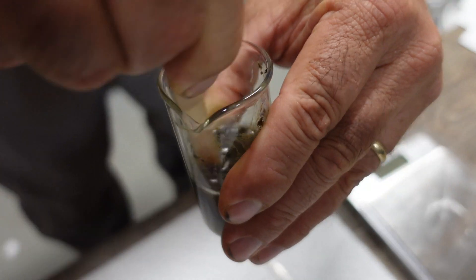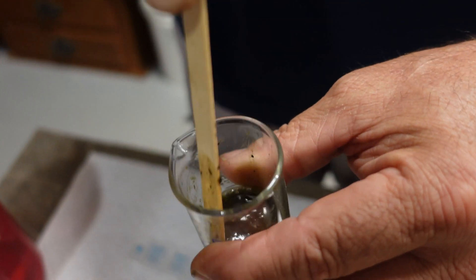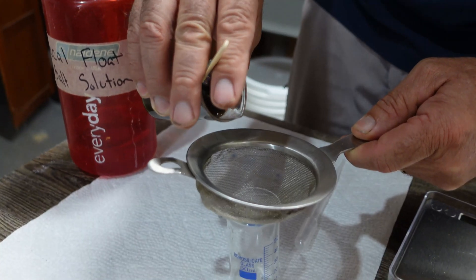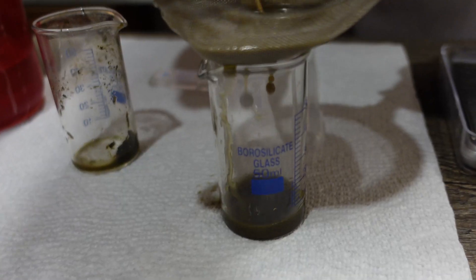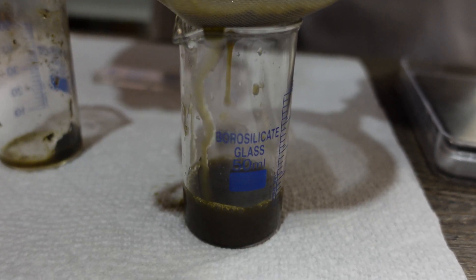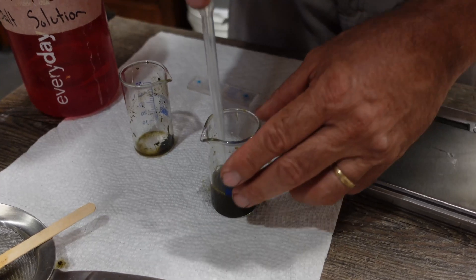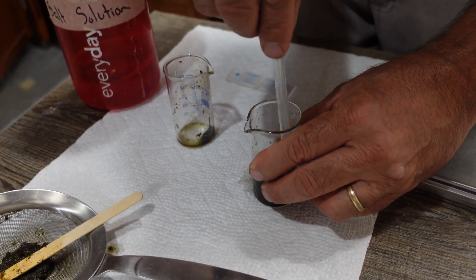Now that we have the 4 grams of feces mixed in well with the 26 milliliters of salt solution, I'm going to take the vial that I poured the salt solution out of, use this strainer over it, and pour that in there. We'll stir it around and get all the salt solution down, and then discard the feces in the strainer.